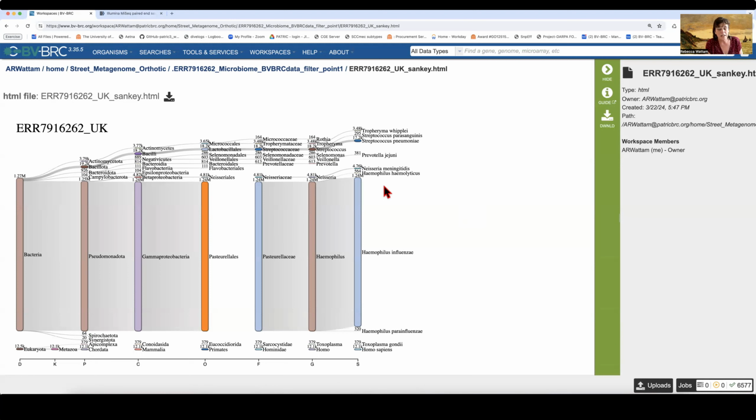I've been doing a lot of manipulations and looking at these things and trying to determine how many reads I need to get a pretty good genome out of a sample. And this one, I can get it. And we're going to do that in a later exercise. I would certainly try to bin out a genome of this and expect that to come out. This guy that has a total of 381 reads, I'm not expecting to get a genome of that.